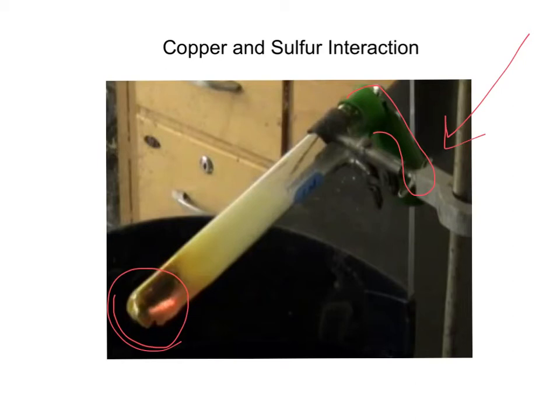After you place everything into your clamp, angle it away from yourself and start heating it. You're looking for a change inside the test tube where you see a glowing light. Usually right before that happens, you get a plume of yellow smoke — that's an indication you're about to ignite inside the test tube. We're keeping it at this extreme angle so it's easier to see the change inside. If it were straight up and down, the outside of the test tube would just get covered in black soot and you wouldn't be able to see inside.